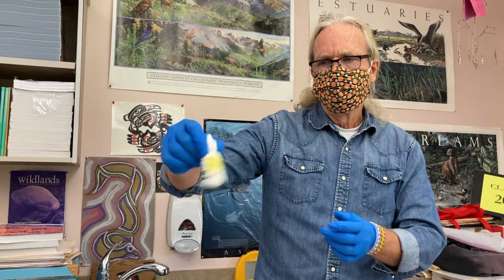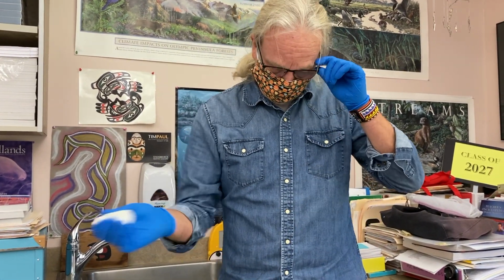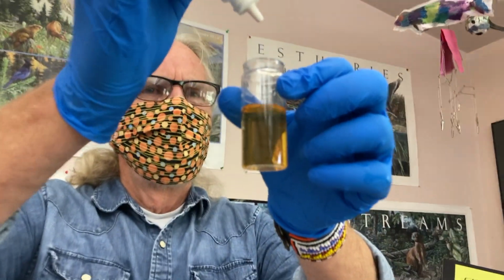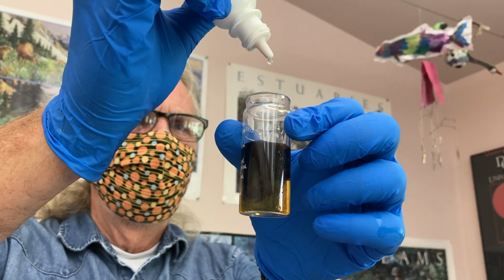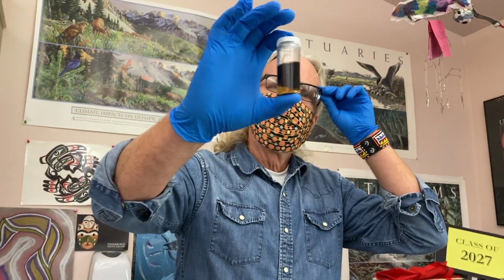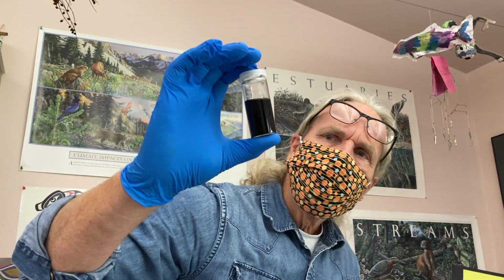The next fluid we add is a starch indicator fluid. Let me make sure, sometimes this needs to be shaken up. And you guessed it, 8 drops. 1, 2, 8. We want that to mix up a little bit. Pretty dark, isn't it? Almost blackish.